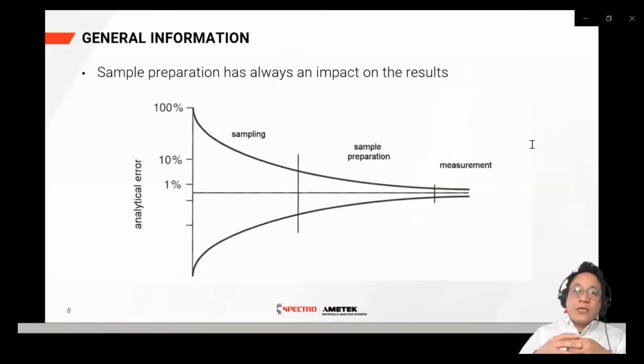Our initial impression is that sample preparation may seem to be the most routine aspect of an analytical protocol. However, it is so critical that analysts realize and remember that a measurement is only as good as the sample preparation that preceded it. If an aliquot taken for analysis does not represent the original sample accurately, the results of this analysis are questionable. As a general rule, the error in sampling and the sample preparation portion of an analytical procedure is considerably higher than that of the methodology used for the analysis.